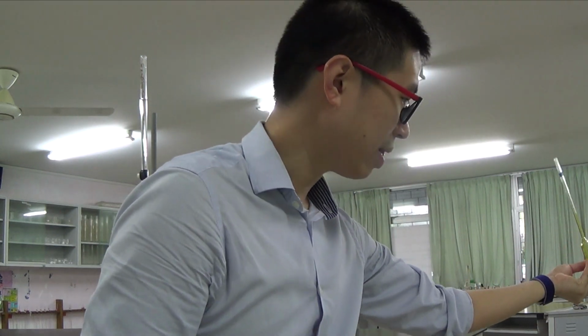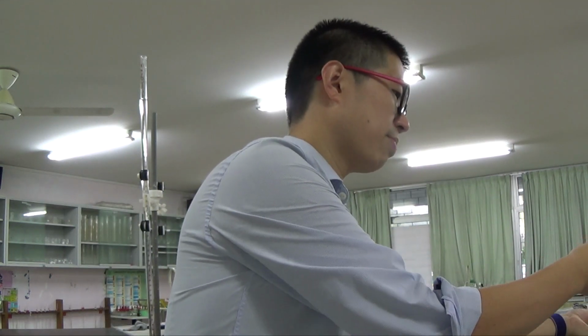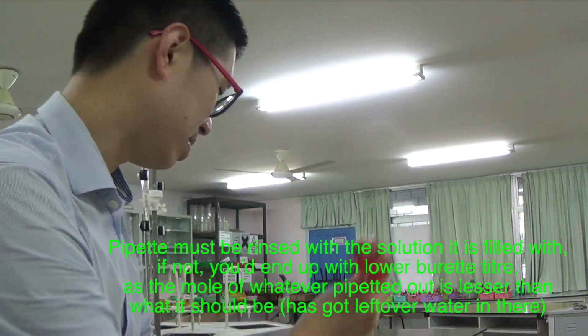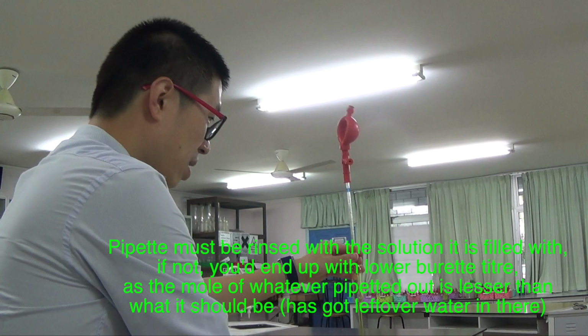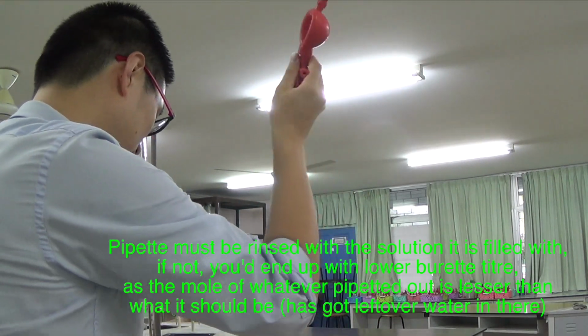With a little bit of it left in the pipette, it's alright because we're going to do a pipette suction anyway. I think the problem is the brown solution is really staining. I don't want it to stain my shirt at all. I should really be careful with this.